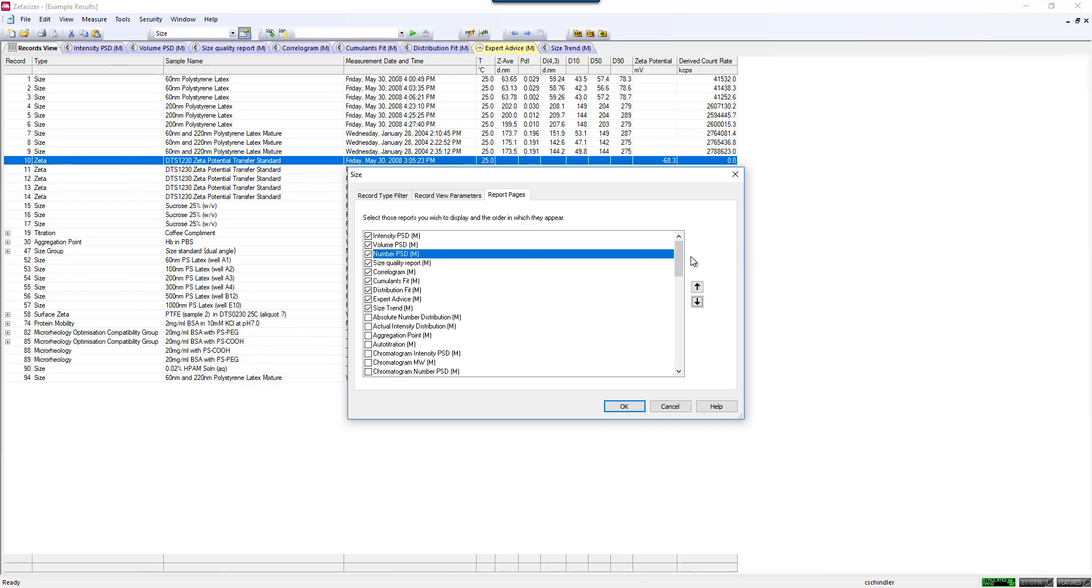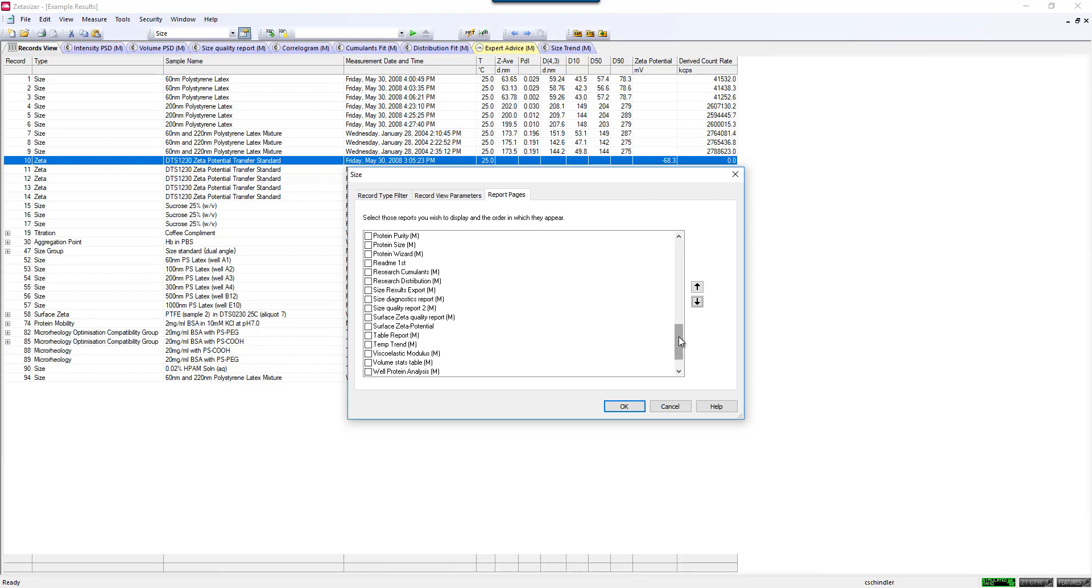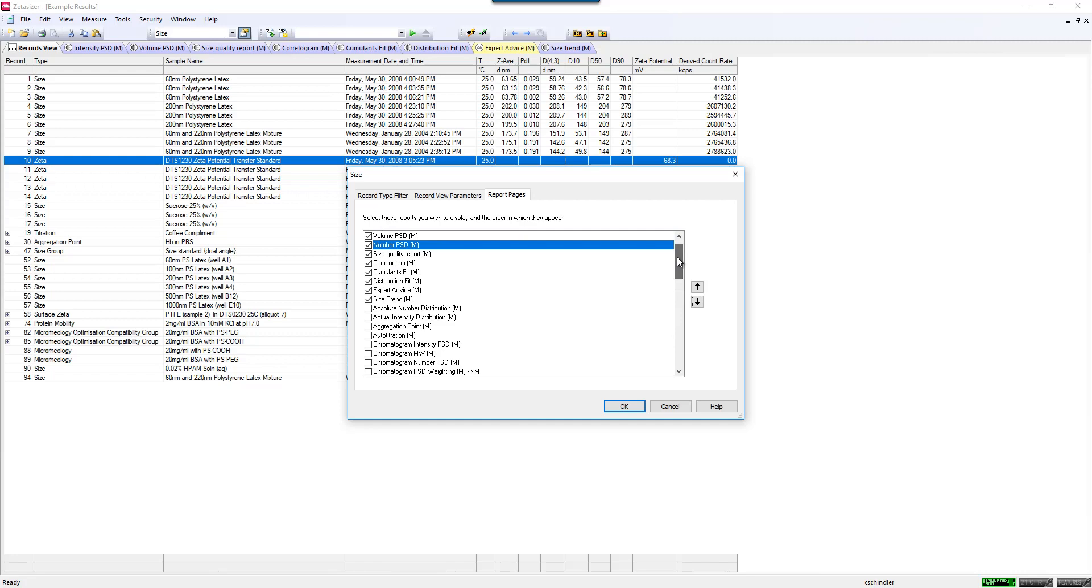Another one that I'll point out is the size trend, and I think I've already displayed that one as well. Here's the size trend. That's one where, let's say you're doing a time study and you want to display z average size as a function of different samples, you can easily set up a quick graph in the software.